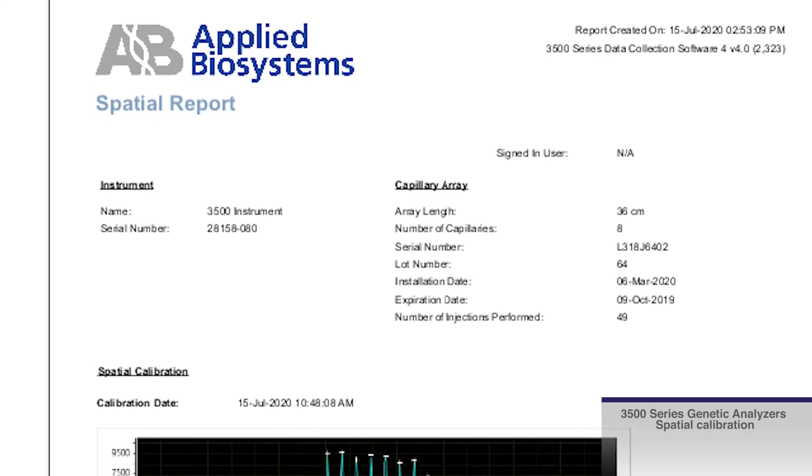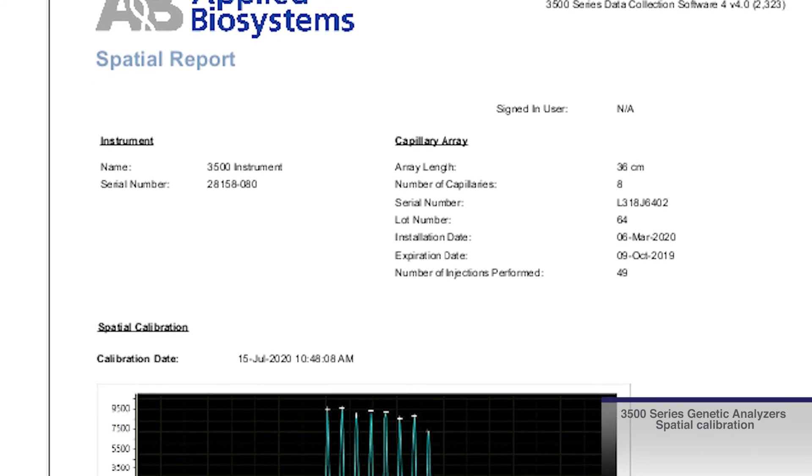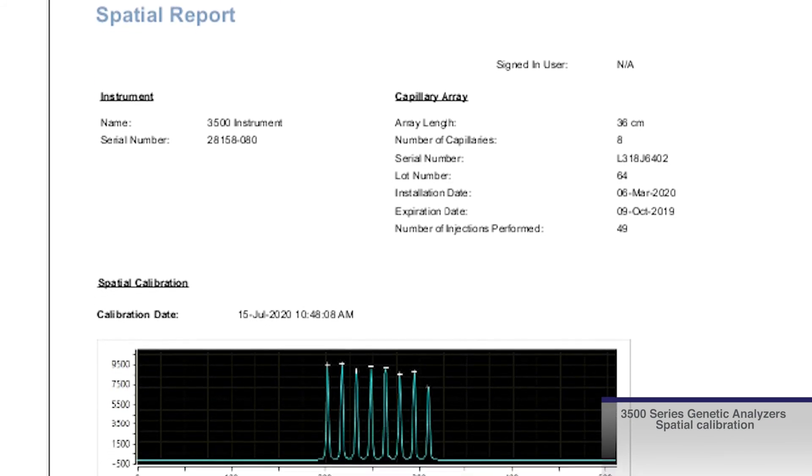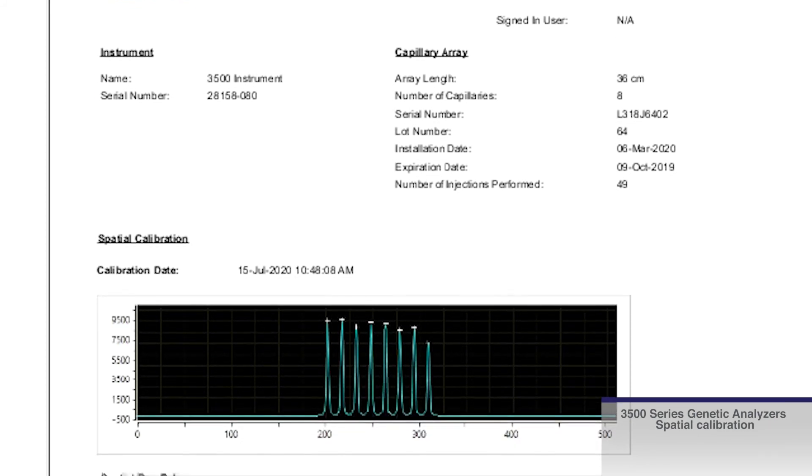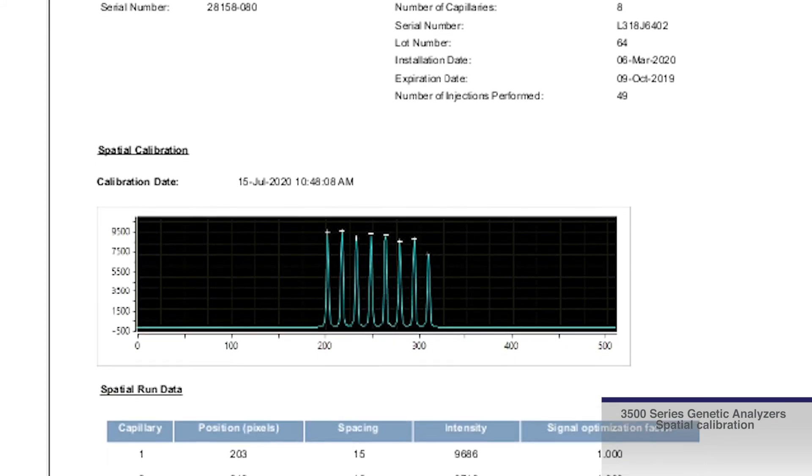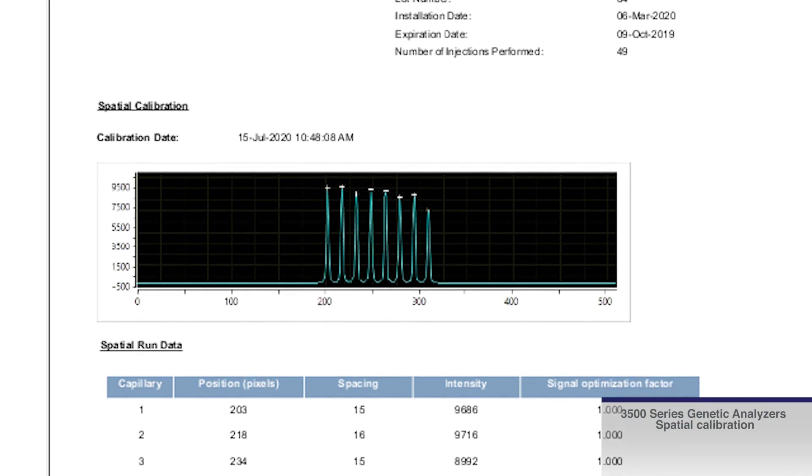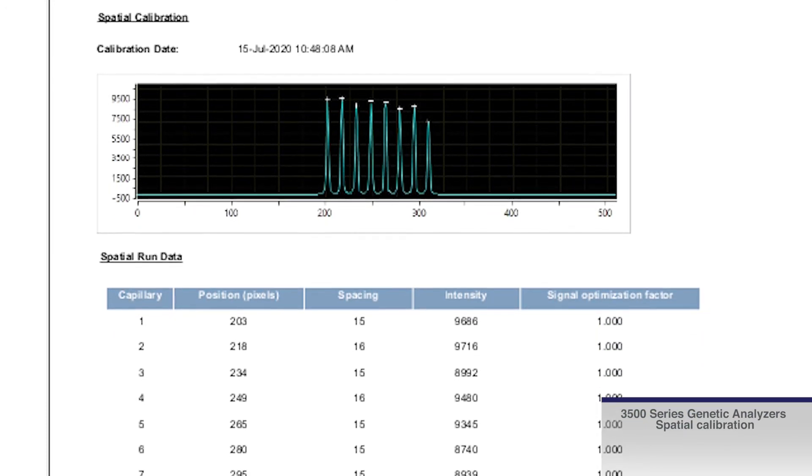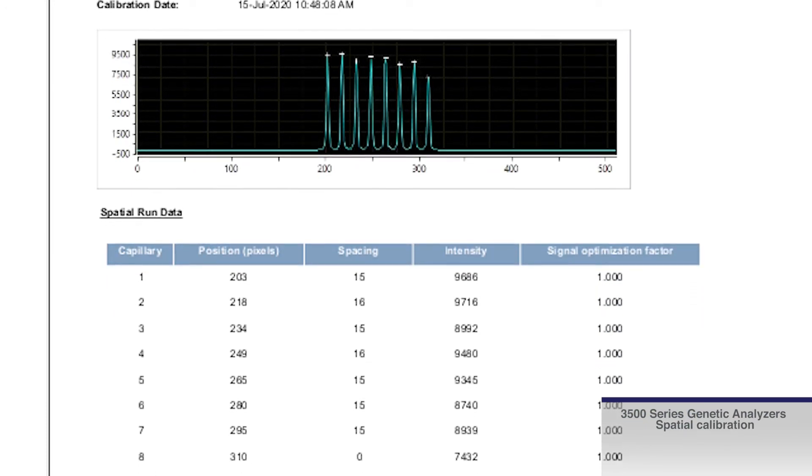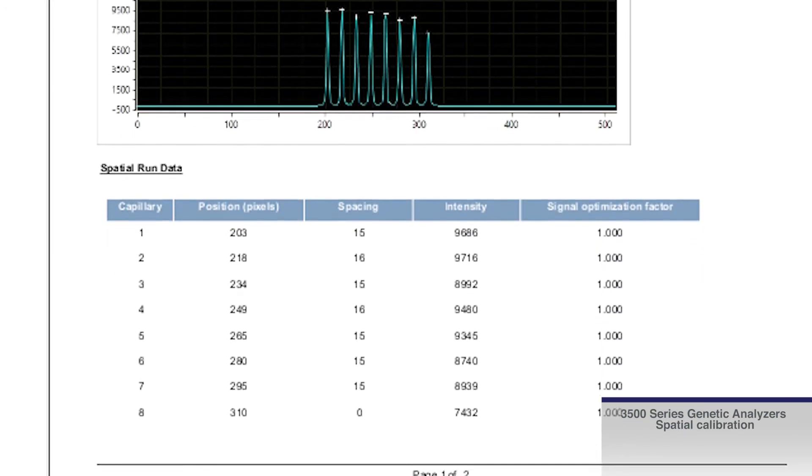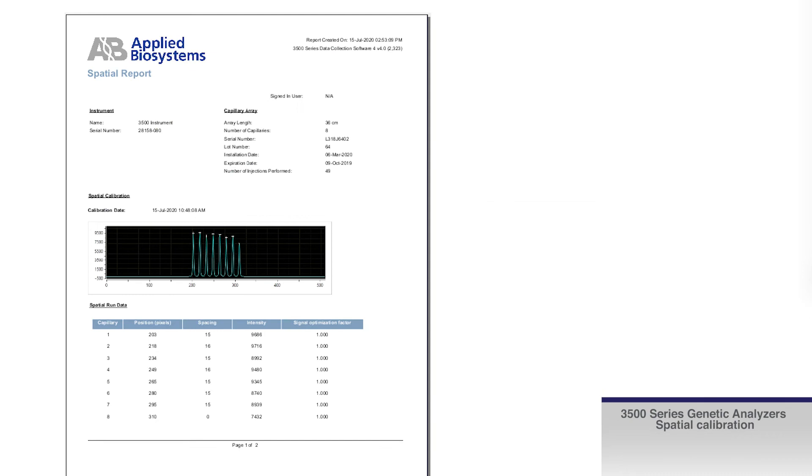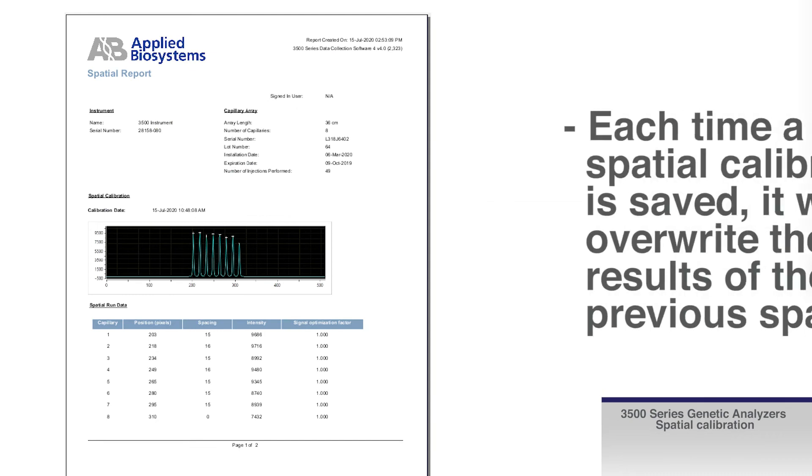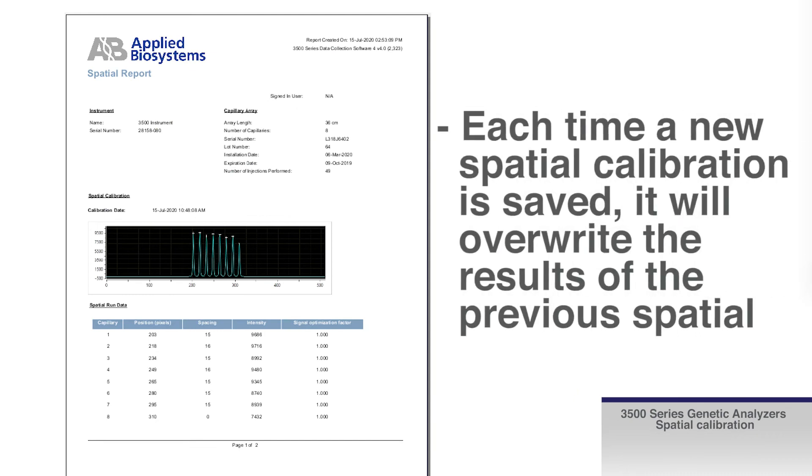Click view spatial calibration report to view the results of your spatial calibration. This data can also be exported to a PDF or text file and saved for your records. Note that each time a new spatial calibration is saved, it will overwrite the results of the previous spatial.